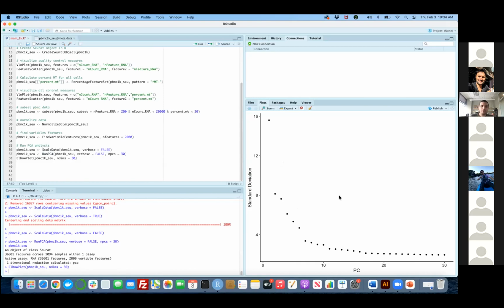Again, what we are trying to achieve with clustering analysis is that we want to pick as many variables as we can without choosing a lot more that will hinder our clustering analysis, pollute it, and give us wrong cell types.